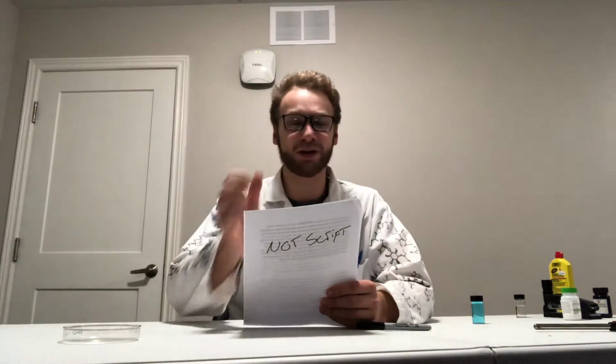The first topic we're going to talk about is absorbance. Now, absorbance is the property of an atom or molecule to absorb light. Taking an atom or molecule in the ground state and giving it just a little bit of energy to excite the electrons into the next energy orbital. The jumping of these electrons absorbs a light packet called a photon from the incoming stream of photons, and this difference can be detected and measured by a machine called a spectrophotometer.